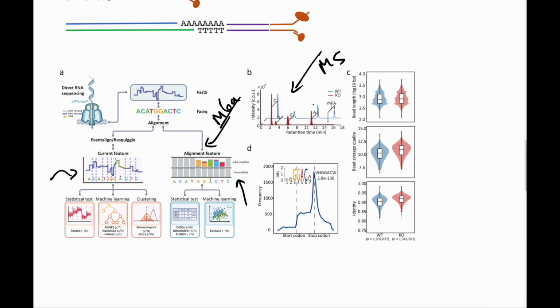They also performed this analysis on two publicly available data sets and these comparisons between tools. One of these data sets was a similar organization, also in mouse embryonic stem cells, wild type and METTL3 knockout, and another was in an entirely different species, the plant species Arabidopsis, with mutants defective of an analogous m6A writer, VIR1.